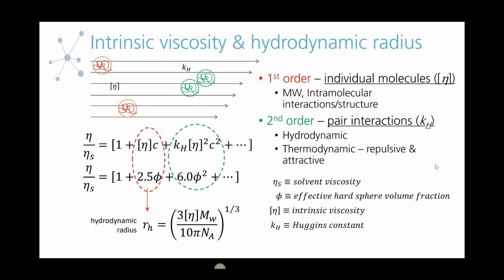The second question that we had was whether we have examples of using our viscosity measurements to study and understand protein-protein interactions. And yes, we do. We sort of considered that a separate topic. Since we're on the topic of intrinsic viscosity and hydrodynamic size, we've done experiments on proteins in different buffer formulations to do an intrinsic viscosity analysis and look at both the intrinsic viscosity and the Huggins parameter, which is characteristic of how these proteins are interacting. So we've done intrinsic viscosity measurements on protein systems using those parameters to understand that.